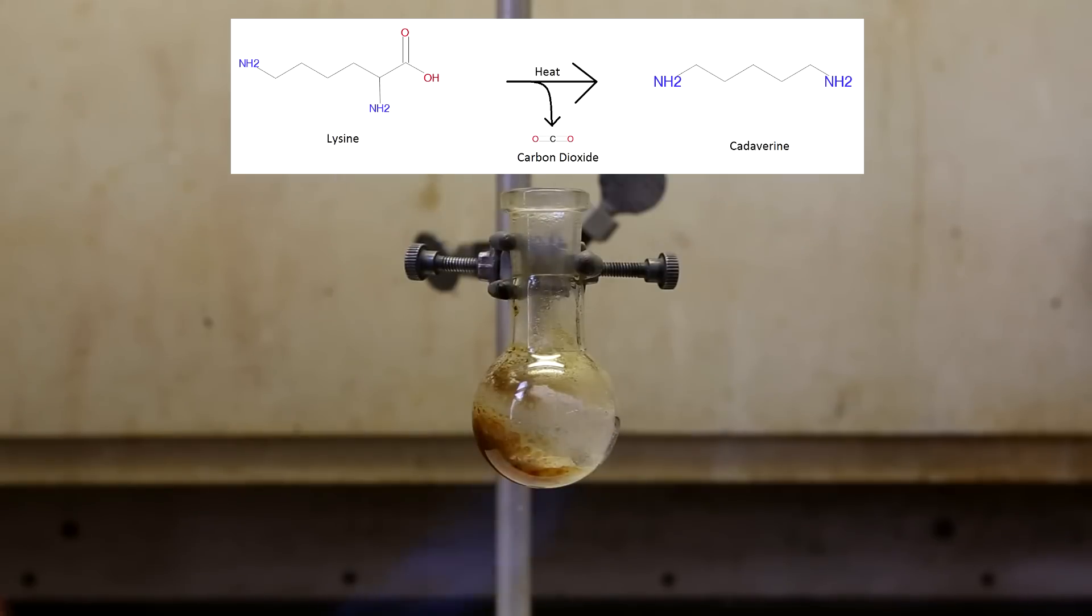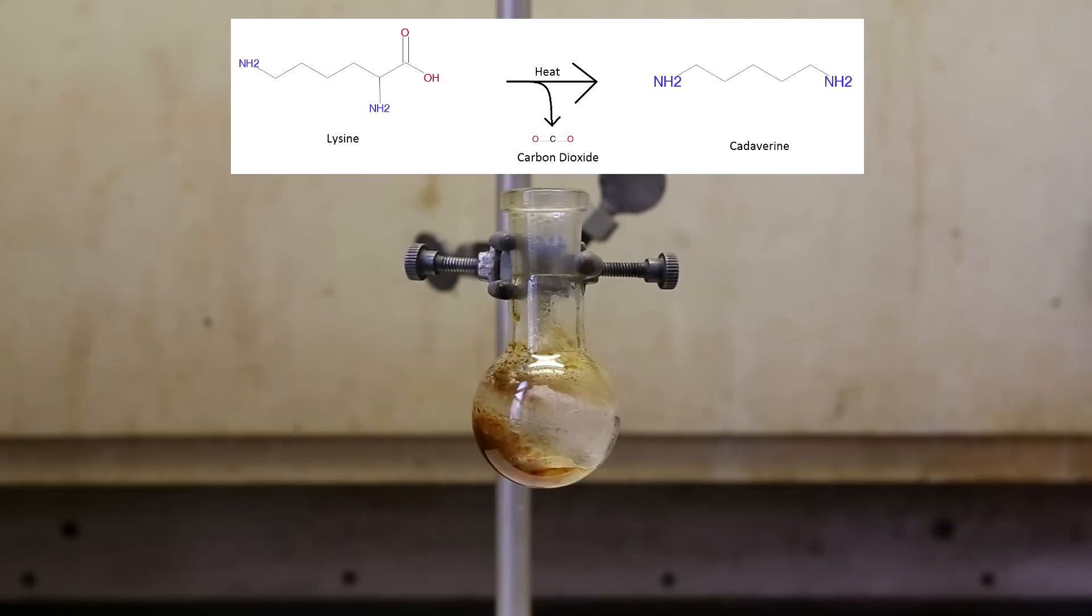Because the decarboxylation reaction results in the loss of one carbon atom, this reaction can be used to shorten a carbon chain. Once the carboxylic acid group is kicked off, we are left with a very simple diamine called cadaverine. While the lysine is a white powder, the cadaverine is an oil.